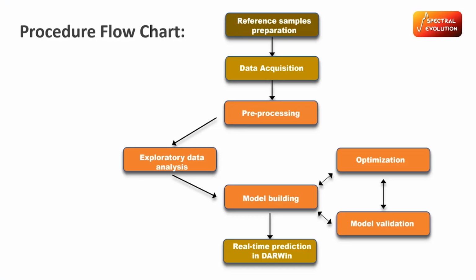We'll build a model from a training set, those reference samples, so known samples with different amounts of nitrogen. And then we can build a model and validate that model based on that training set. So then once we have that model built, we can attach that to any new scans that are happening and get an answer based on the model in real time in the field.